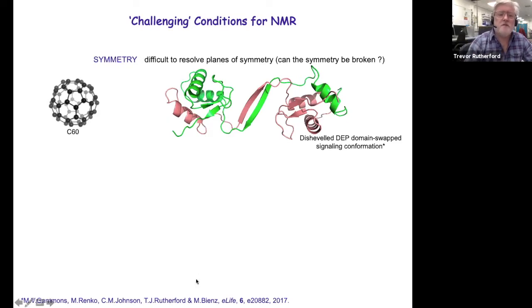If we look at, for example, fullerene molecules, C60, one of the key features of determining the structure of this molecule is that every carbon in a C60 molecule has the same magnetic environment. So you get a single NMR signal for 60 carbons, which is telling you an awful lot to constrain how you would do model building in order to make up something that has that form of symmetry.